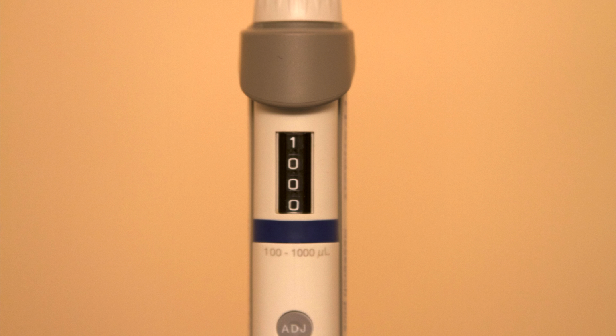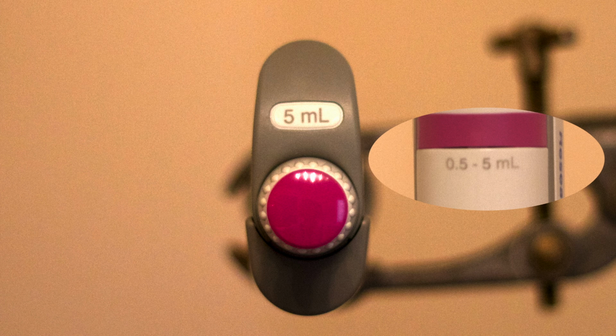This tells us that this pipette is accurate across the volume range 0.5 to 5 millilitres, which can be expressed as 500 to 5000 microlitres.